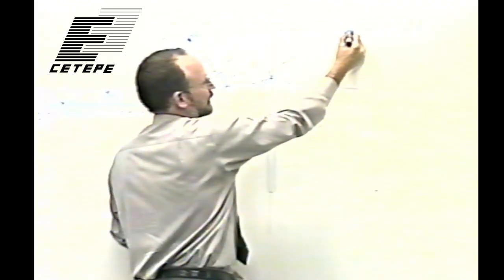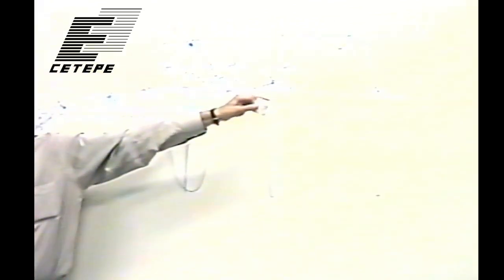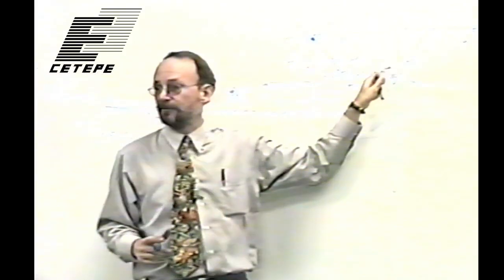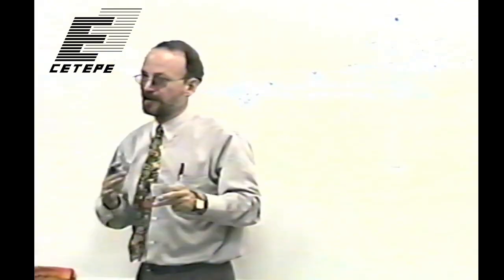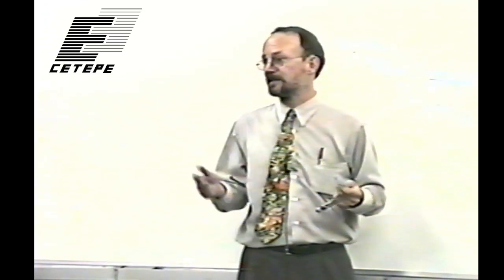but they'll often put a reflective layer of aluminum so that the light that goes in that direction will be reflected back down. So this increases your efficiency, but it hurts your spreading because this light can move even further. But you can do trade-offs between screen thickness, reflective layer, and black powder. There's a technical name for these black powders, but they're opacifying agents. So this is what the science of screen manufacture is all about.